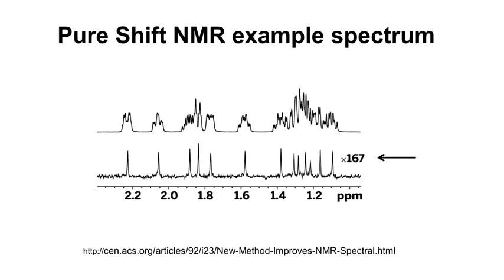but just like with UltraFast NMR, it's relatively insensitive. Typically you have to have higher concentrations, and you have to acquire not just in a minute, but 10 minutes or 20 minutes, just like a 2D spectrum. But if you can get that level of spectral simplification, it's probably worth it.